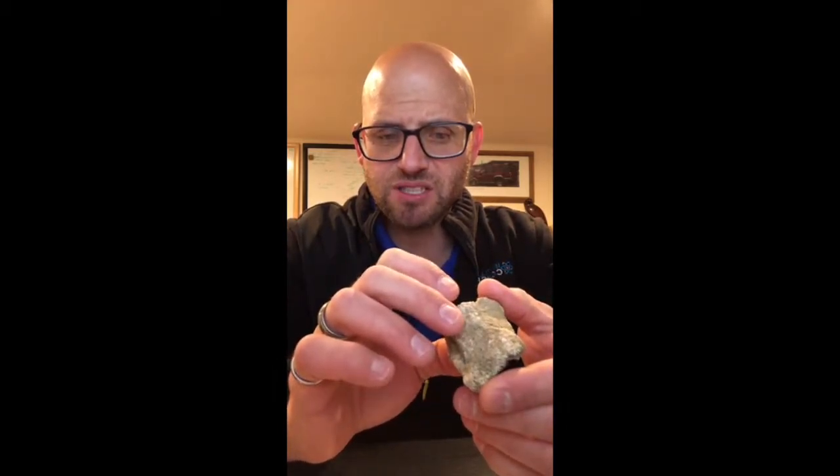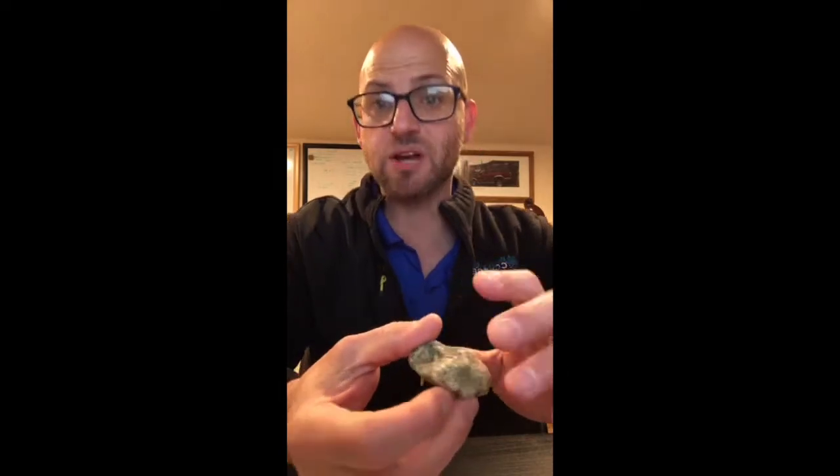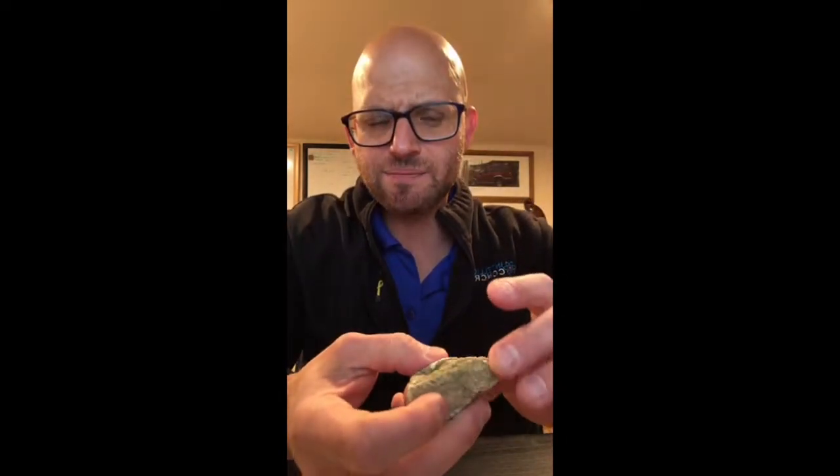And that's the thing. Most of this use of microscopy is just a bunch of bullshit, where you're looking for a micro needle in a mega haystack, and you could take a picture and then move over so many pixels and get a picture that proves your theory otherwise. So more often than not, that whole concept of using microscopy to solve the problem or justify something falls in the realm of bullshit.